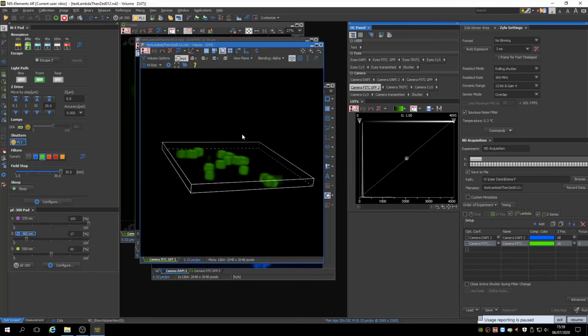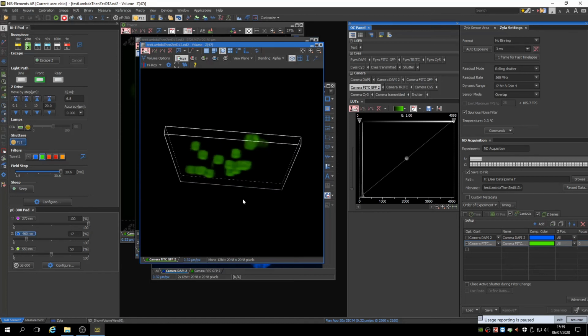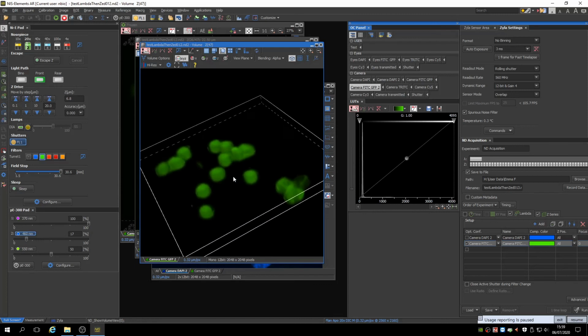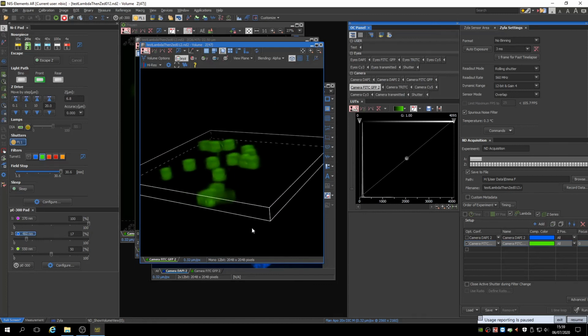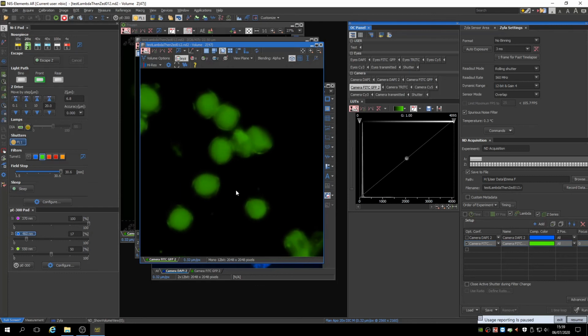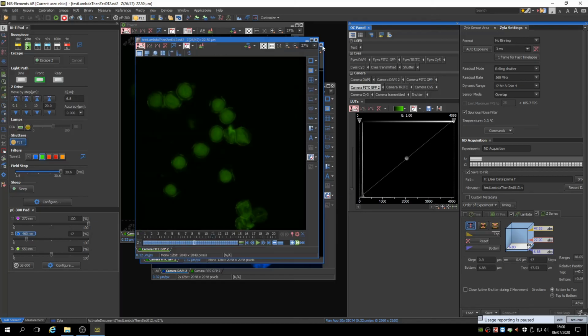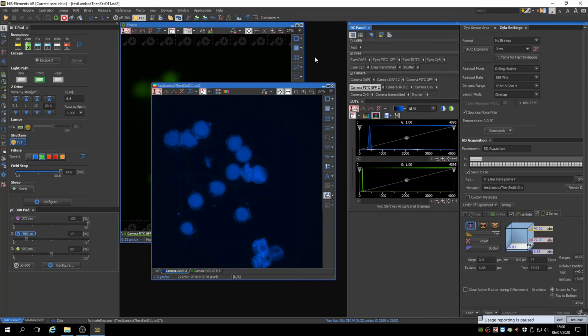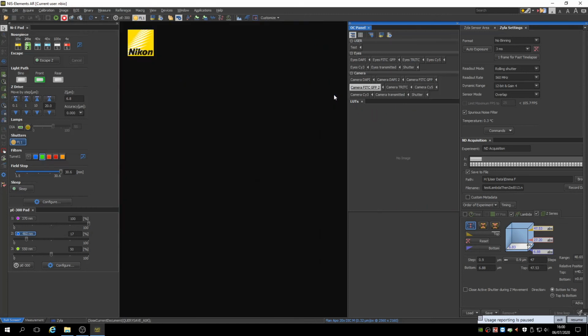We can spin this around and zoom in. As you can see, this wouldn't be the most helpful image for measuring volumes or spatial differences between different areas on the Z-plane, as the widefield microscope takes in too much unfocused light to give a clear and accurate picture along the Z-axis. To shut everything down, make sure you saved everything you want to keep, then exit the software and remember to log out of the PC and shut it down if you're the last user booked on for the day.